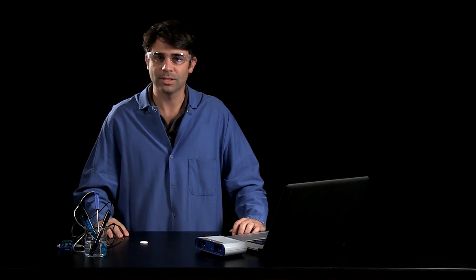Hi, this is Tom Loschiavo, Chemistry Education Manager at PASCO Scientific, and I want to introduce you to the Advanced Chemistry Sensor.